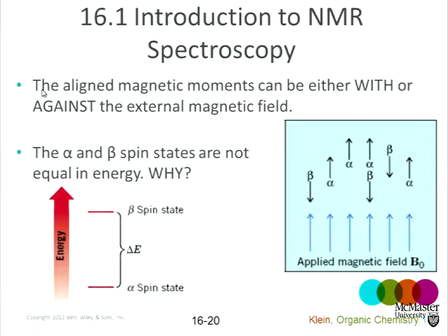That's the baseline of our carbon-13 NMR spectrum. Too much energy, we can't do that transition because the photon has to be completely absorbed to cause the transition. So we need exactly the right amount. And you'll notice in the carbon-13 NMR spectra that we get very sharp lines, very sharp peaks, high resolution. Two carbons that are very similar but distinct, very close in chemical shift, but we can see two lines still, and we can therefore count the carbon atoms.